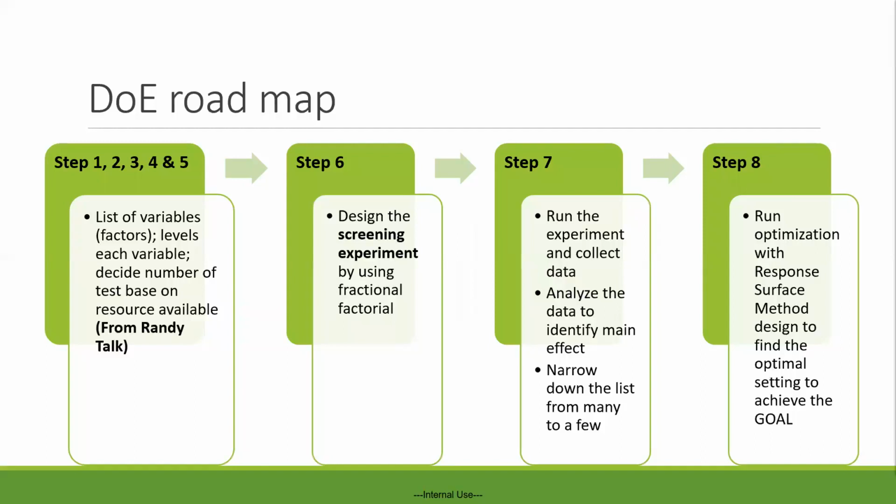Here is the DOE roadmap. Randy has walked us through steps 1 to 5. I'm going to show steps 6 to 8. Step 6, we will design the experiment by using the fractional factorial option in Design Expert. This will be the software that I will use for my talk.